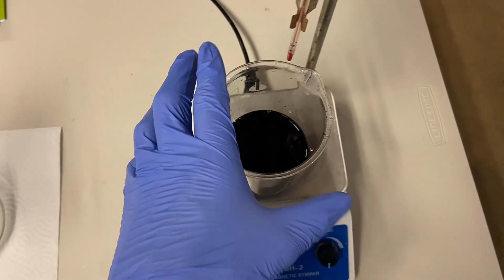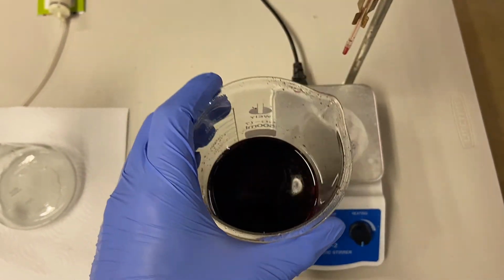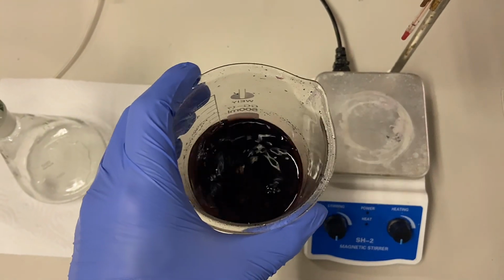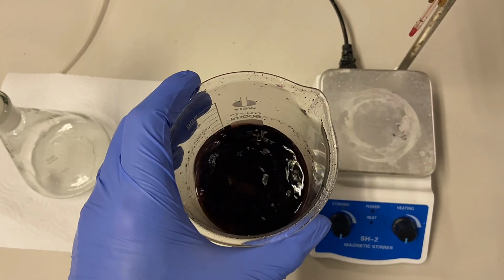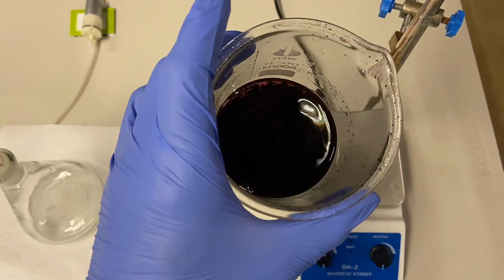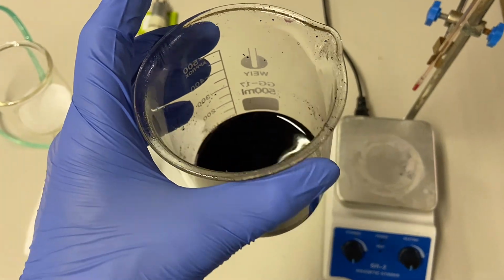Okay, so not everything has dissolved. It's been a good couple of hours. You can still see there's a decent amount of the black mass in there. Now, even with some quite powerful acid and hydrogen peroxide to really boost its reactivity, while heating it quite high, not everything's broken down and dissolved. So I think I'm going to move on to the next step anyway.